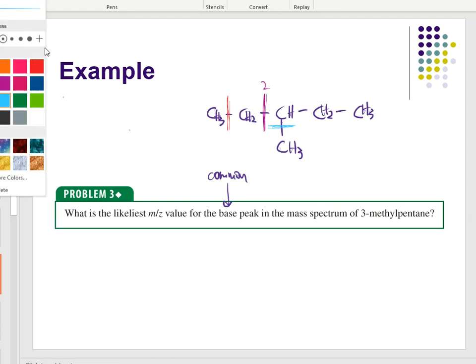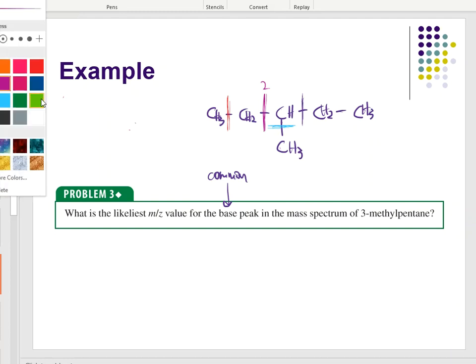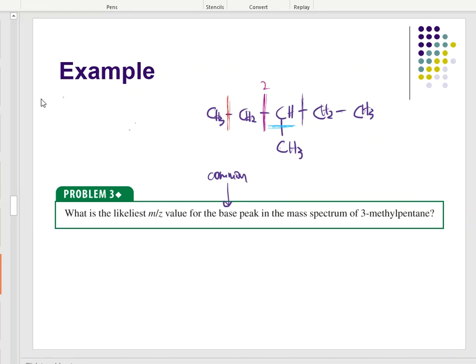All right, then I move on to my next one. It looks like I can maybe cleave it here. What I have now is a 2-carbon piece and this 4-carbon piece. But you know what? This is the same as that purple one that I've just drawn, right? Because look, if I cleaved it here, I get a 2-carbon piece and the same 4-carbon piece on the other side. So that's actually already been taken care of. I don't even have to write down that option. I don't want to get you confused. I'm not even going to write it in the same color, because that's not a choice. It just ends with the same thing.